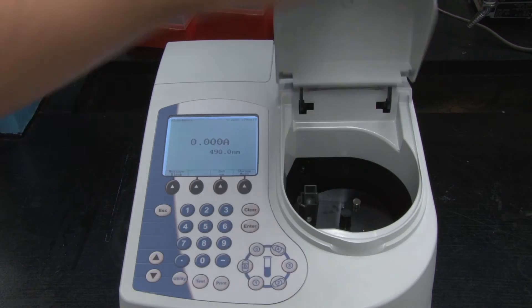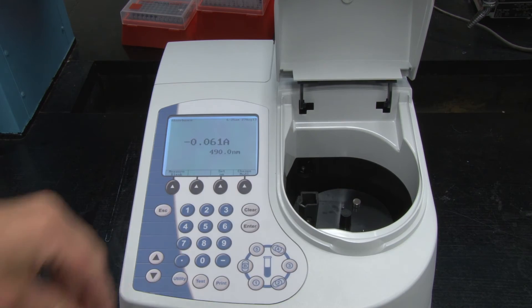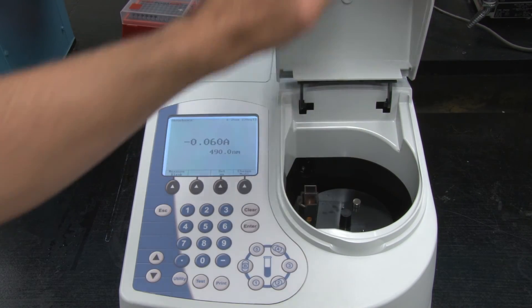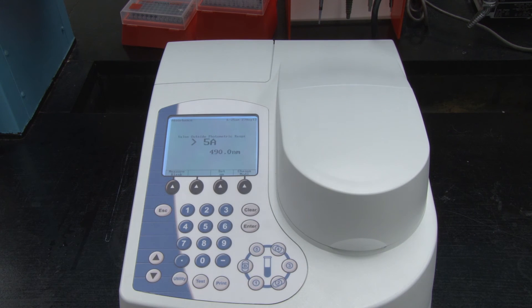After blanking, remove the cuvette and insert your sample. The spectrophotometer will read the absorbance of your sample and report it on the screen.